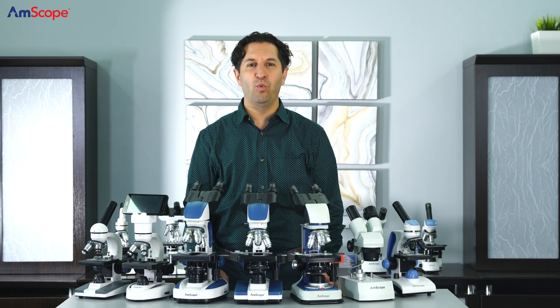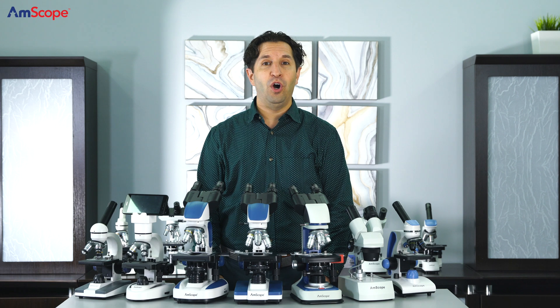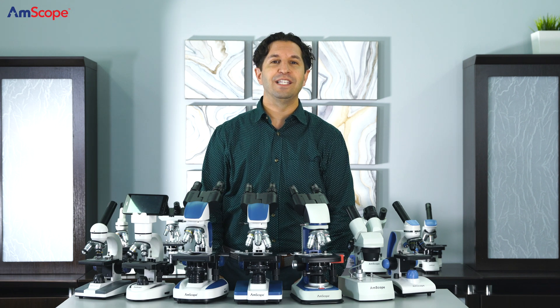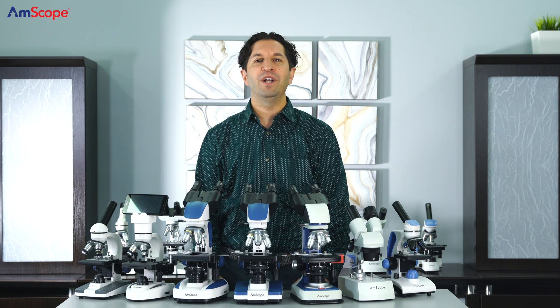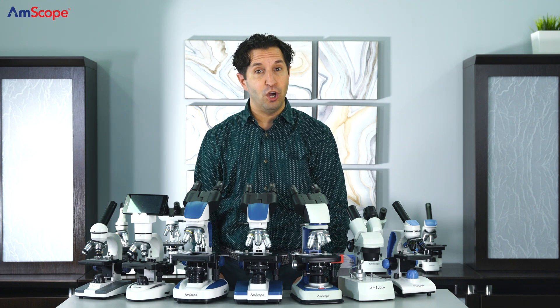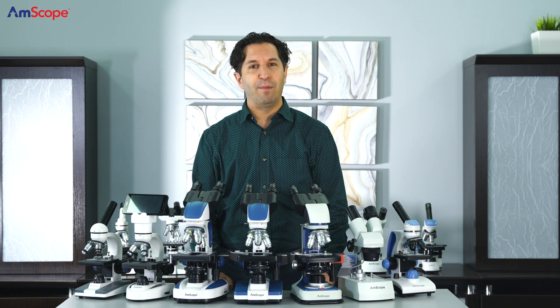Hi everybody, and welcome to the wonderful world of Amscope. For almost 20 years, we've been a leading online retailer specializing in selling microscopes and accessories around the globe. We offer an industry-leading collection of microscopes, microscope cameras, accessories, and related laboratory products.